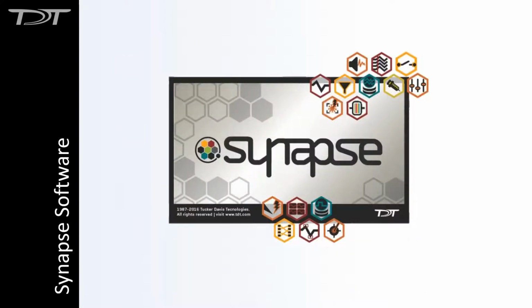So with that, that concludes our hardware section going over the RZ10X. Now we'll be moving on to the Synapse software, which is what's used to control the RZ10X. And we'll be discussing the new features that we've added in.